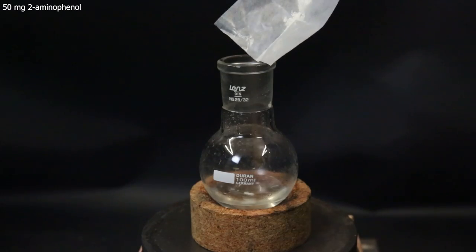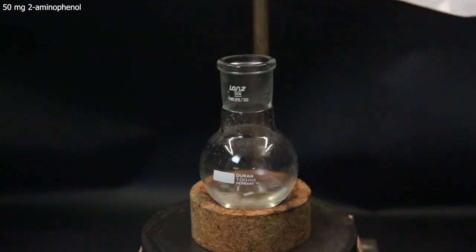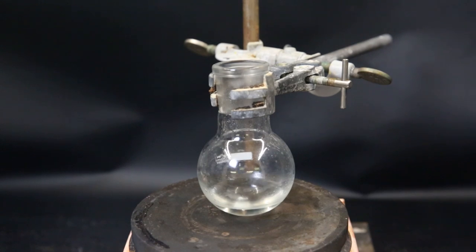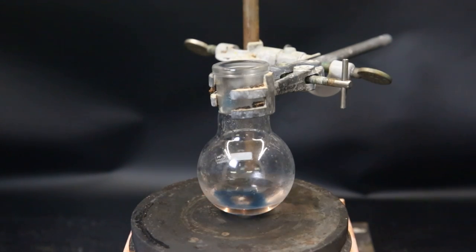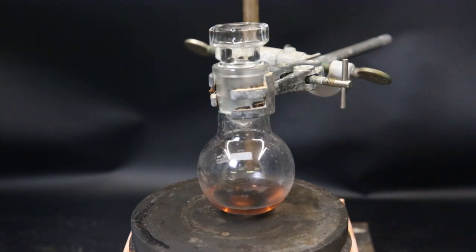Afterward, I add 50 milligrams of 2-aminophenol. Then I clamp the flask down and start stirring. Now to start the reaction, I add 200 milligrams of copper 2-acetate monohydrate. I simply stopper the flask and leave it to stir for a few hours. We can see the reaction mixture quickly starts changing color.